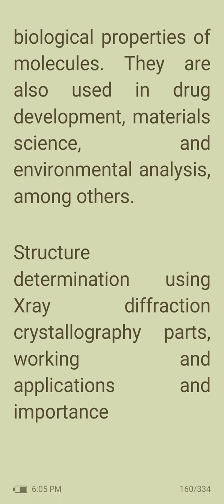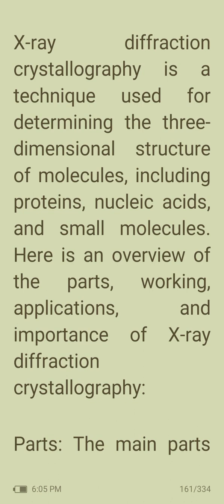So, structure determination using X-ray diffraction crystallography. Next topic is the structure determination using X-ray diffraction crystallography. X-ray diffraction crystallography is a technique used for determining the three-dimensional structure of molecules, including proteins, nucleic acids, and small molecules. Here is an overview of the parts, working, applications, and importance of X-ray diffraction crystallography.